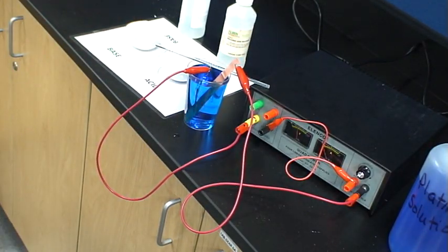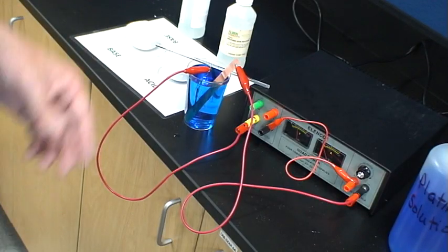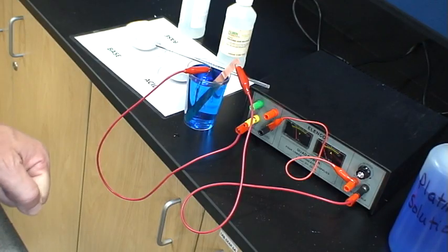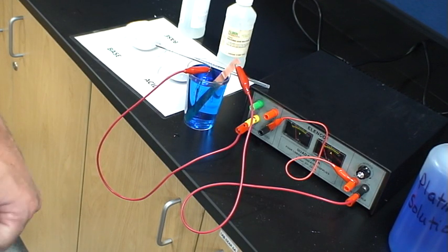Have fun with the Electroplating with Copper Lab, but also remember, you've got to collect some data as we go with it, because there are going to be some calculations using Faraday's law. All right, good luck, guys.